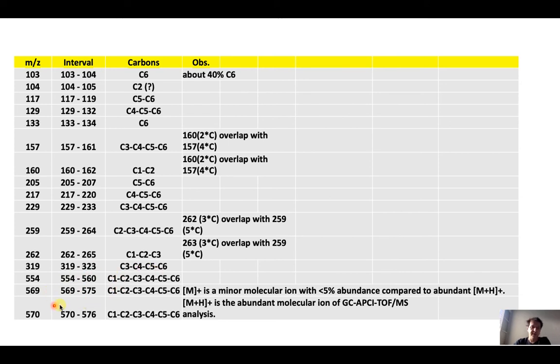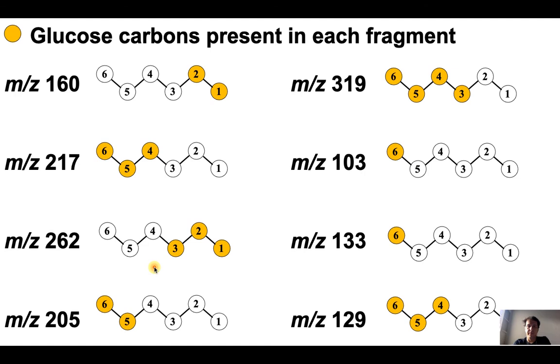And these peaks with high mass to charge ratio are quite problematic. The intensity is not that high, and they do not follow the labeling pattern observed in the other fragments. So in the samples that we have analyzed, we cannot trust any of these fragments. Actually, it is the full molecule. So with this, we started to make the calculations of how to estimate the enrichment in each atom position.